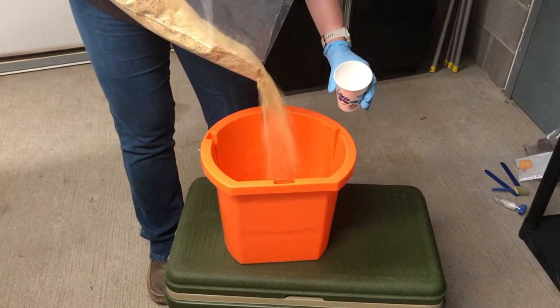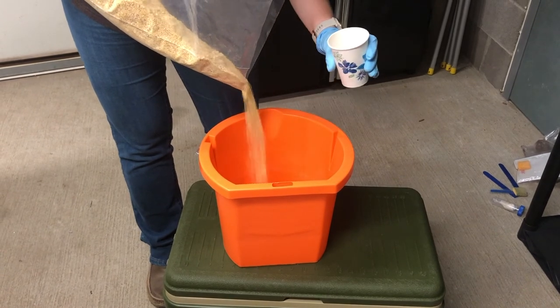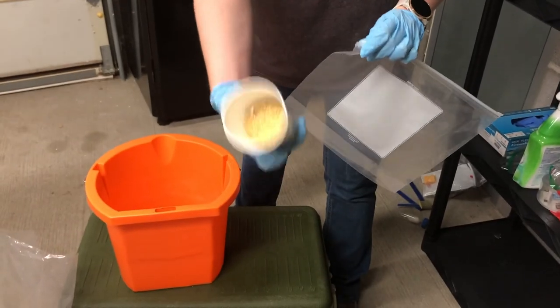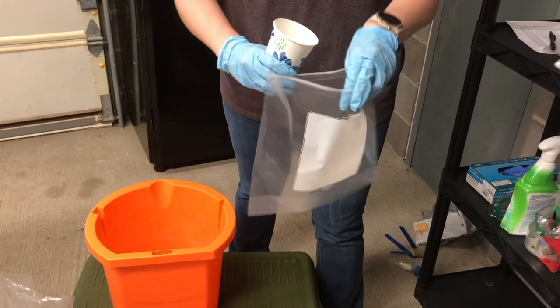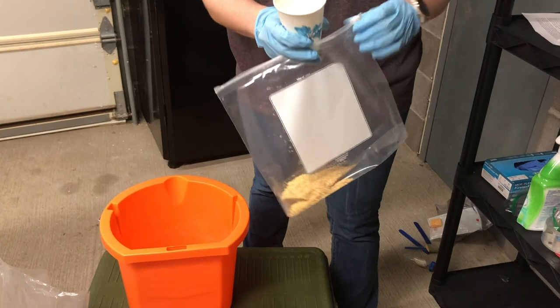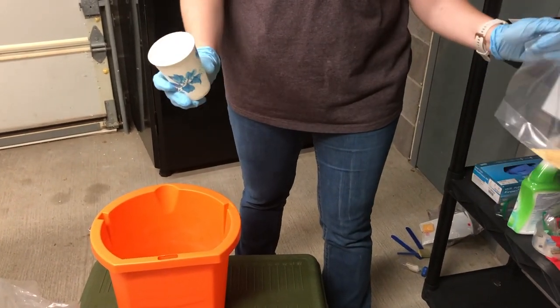Place the 8 ounce cup underneath the stream of the desired sampling ingredient or material and fill it up halfway — about 4 ounces of feed collected within the cup. Then dump the contents of the cup into a single plastic storage bag. You'll need to sample the stream 9 additional times, evenly spaced in time throughout the load, ensuring that each sample goes in the same plastic bag.